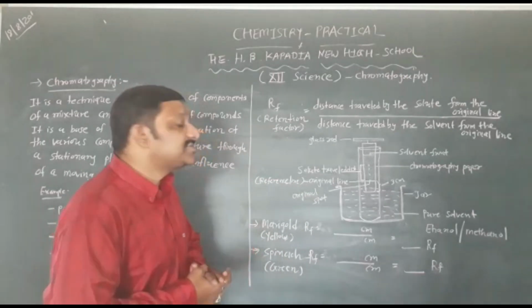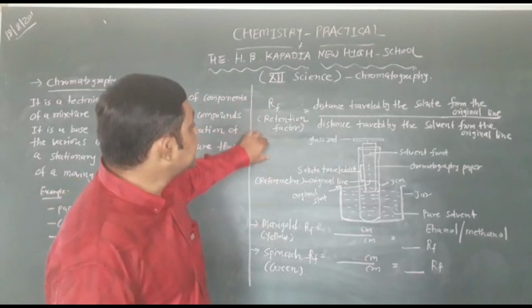Okay. Now the next topic is RF value, the retention factor.